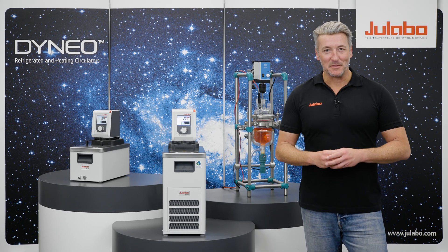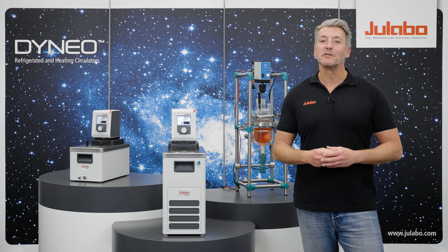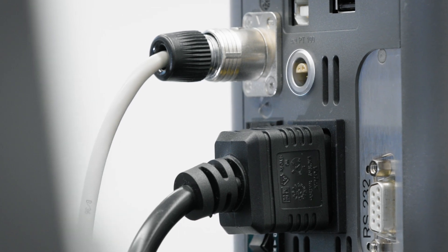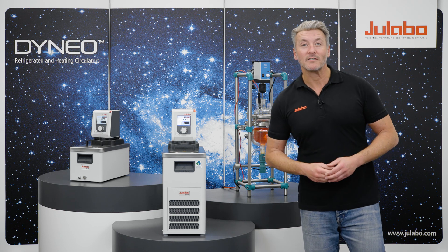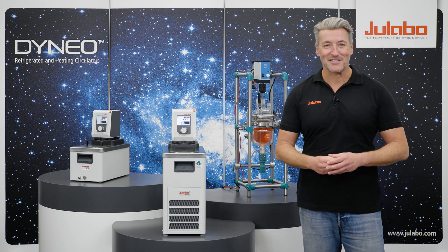Hello and welcome to JULABO. My name is Alex and today I will show you how easy it is to connect an external application to your DYNEO circulators. DYNEO units have an integrated connection for an external PT100 temperature sensor. This makes it the perfect match for a glass reactor application. In this case we connect the DYNEO to the primary circuit of a glass reactor, which then temperature controls a specific reaction.